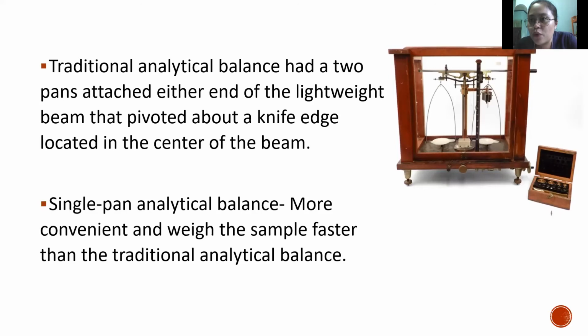So ingana iyahang nawong ato mga sa una pa ng mga analytical balance where on the other side you will place the object na i-weigh and then on the other side you will be placing weights. Kanang mga weights gani nga predetermined na ang ilahang mass. So naay mga weights na 5 grams, naay 1 gram and so on. So hangtod na magpantay na silang duha dinha, and that's the time na mao na siya ang iyahang final weight sa imong object. You just have to add all the masses of the weights nga gibutang sa opposite na pan.